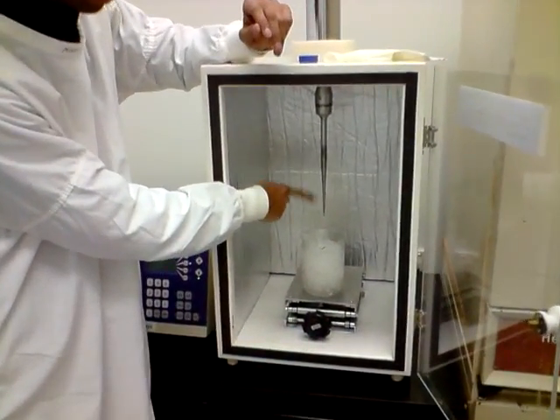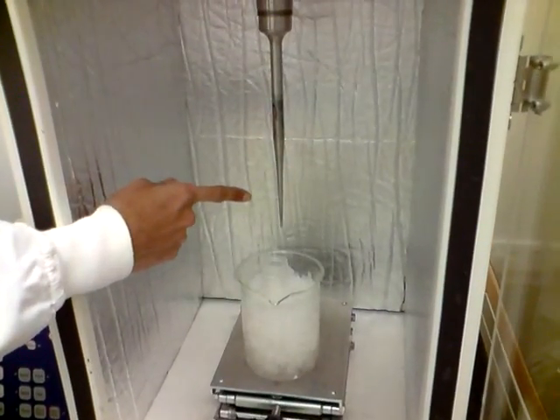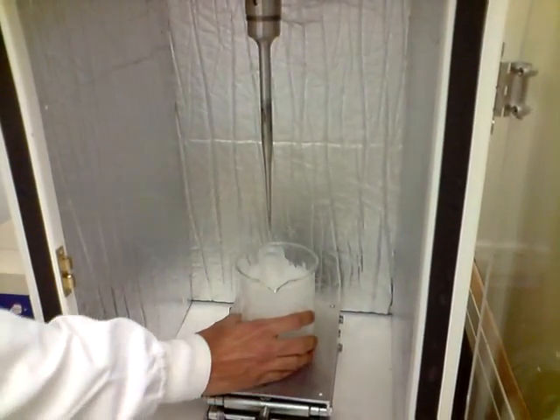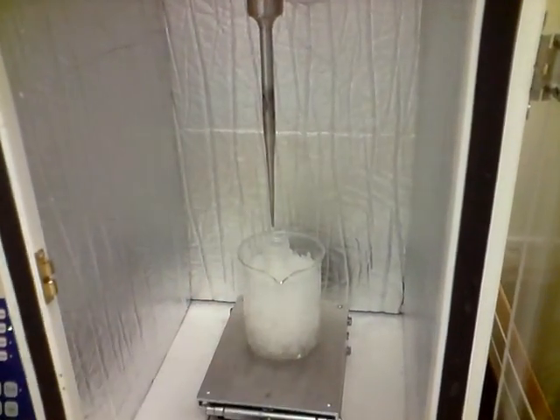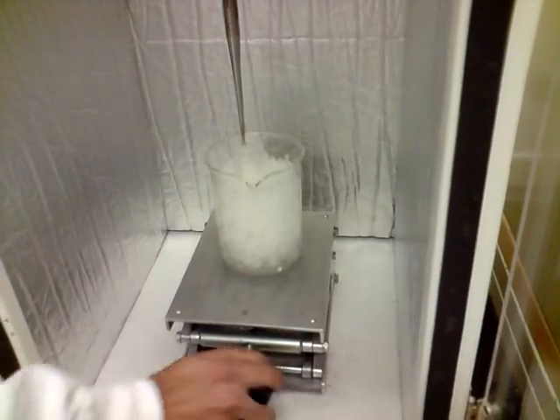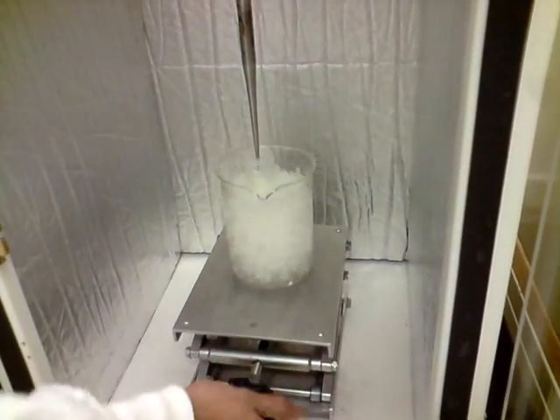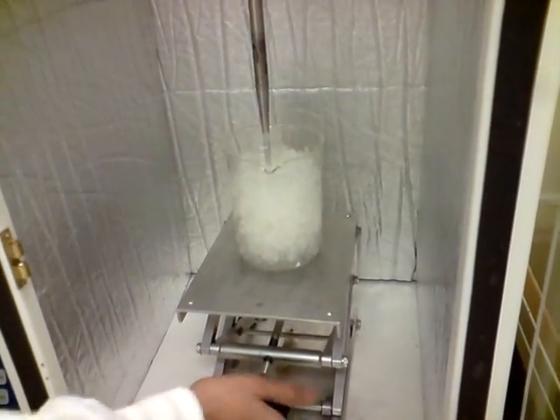The needle here that you can see is the sonicator needle. It will emit high frequency sound waves and it will be dipped right inside the bacterial culture. We will just dip it down until it goes right into the culture solution.